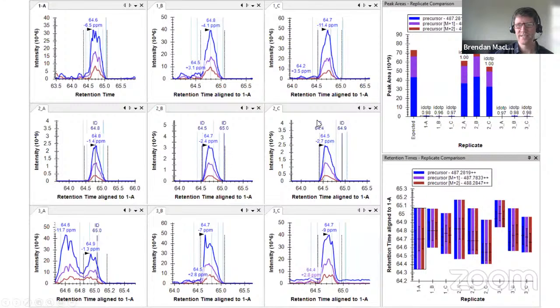And the cause of that is that this is so abundant that it gets seen really early, it gets sampled, and then there's dynamic exclusion, and then maybe it gets seen again after the dynamic exclusion wears out, if there's enough still left. But you can see it's only detected in certain runs, but Skyline uses alignment. These light blue lines are Skyline saying, if this ID were mapped onto this other run, this is where it would show up. And then you can see that there are actually quite nice peaks.